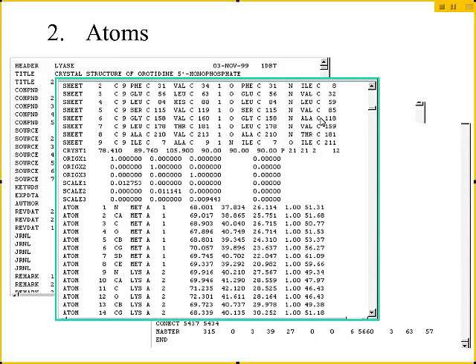Now, there's one line in the file for every atom in the structure. And so the atom lines begin with atom, then there's atom number. And the atom numbers is a TXT file. You can move these lines around. Atom numbers aren't kept track of by the program. So it doesn't matter if you move the atom numbers out of order. So there's atom numbers, and then there's atom name.